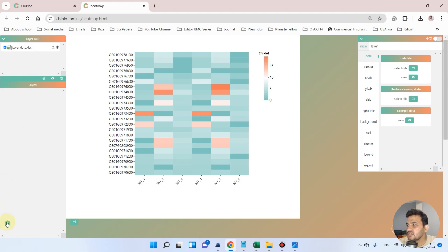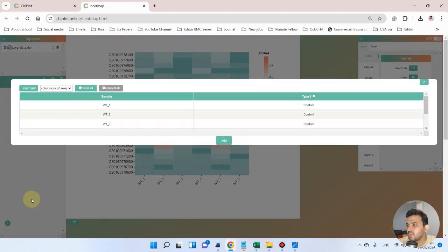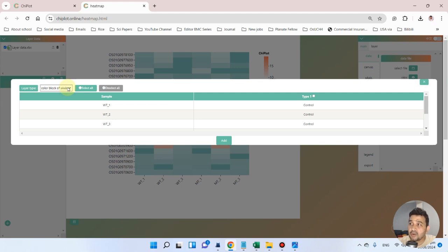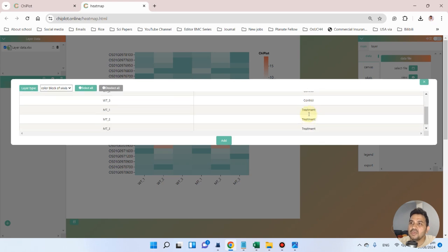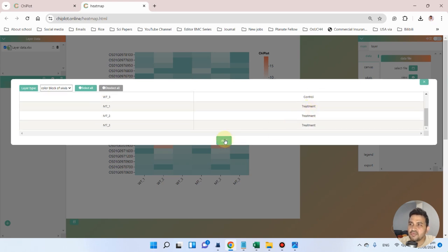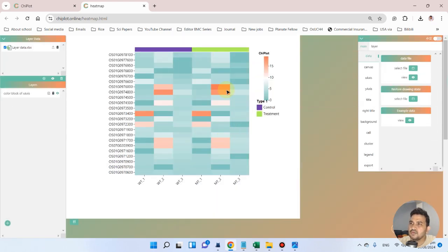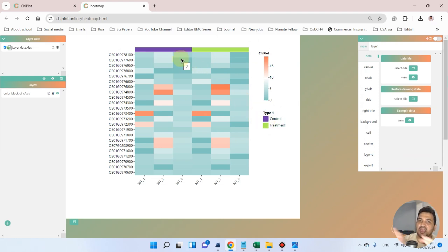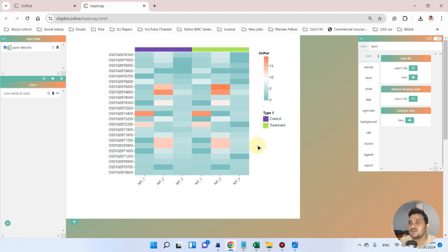After uploading the file, go to the plus sign and add a color block on the basis of the x-axis. On the x-axis we have the control and treatment samples. You can see we have now made a distinction: type 1 belongs to control and type 2 belongs to treatment.